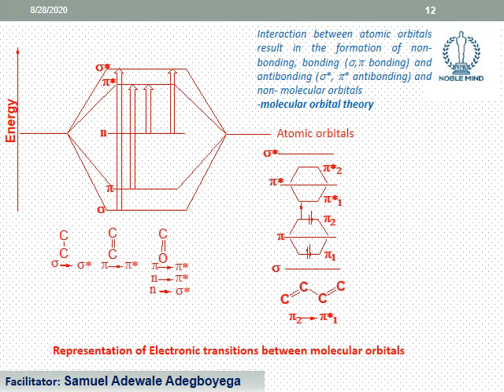But something is happening there. The wavelength is increasing. That corresponds with the formula where we have energy equal to hc over lambda. We say that energy is inversely proportional to the wavelength. So the higher the energy, the lower the wavelength. And when the wavelength increases, definitely the energy of absorption will reduce.